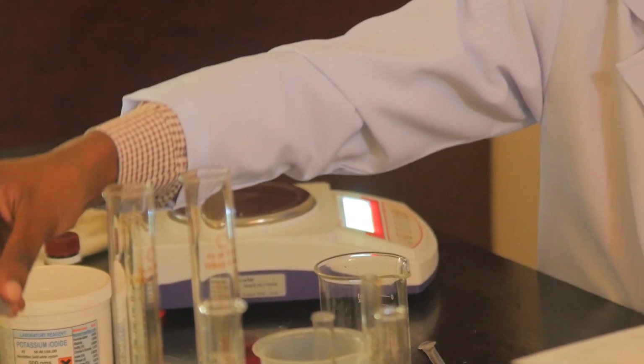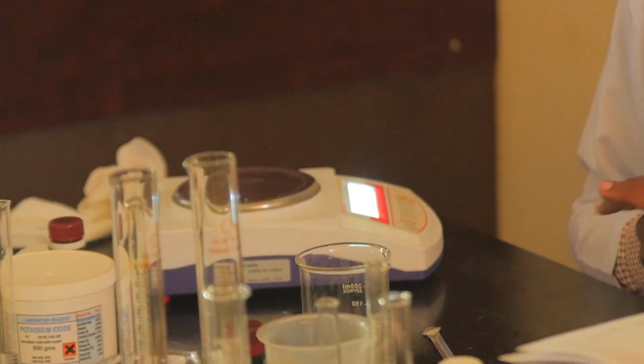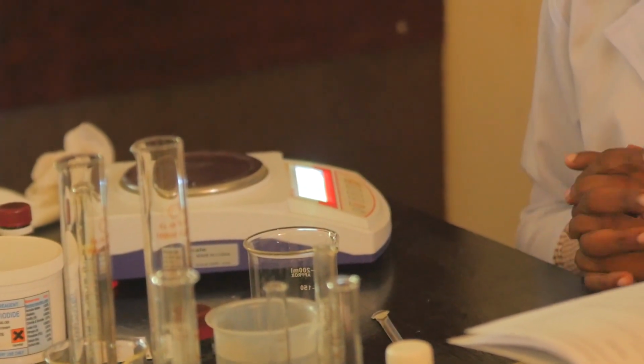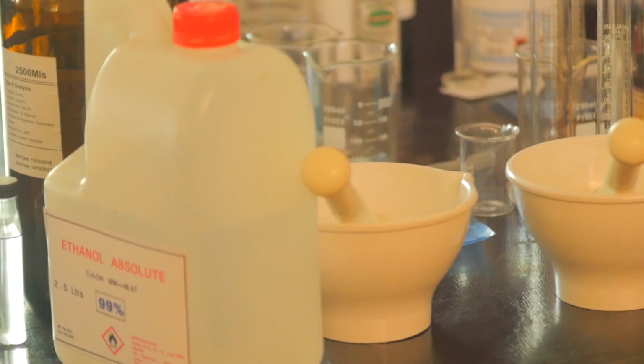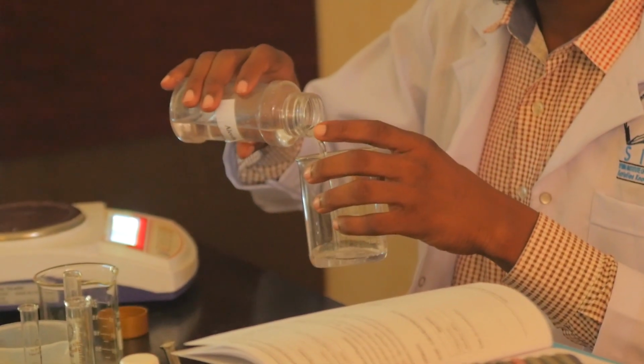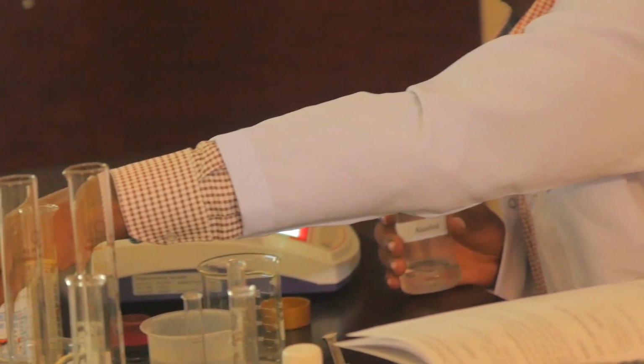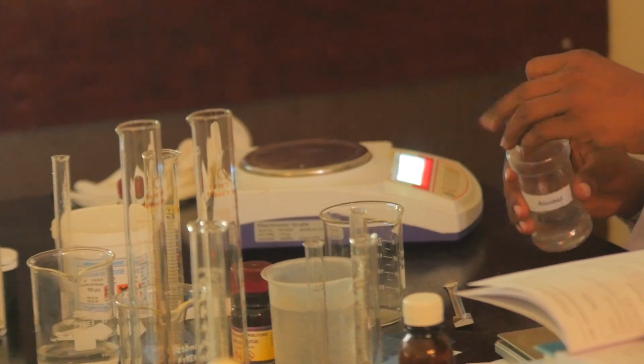After that, we are going to take some amount of alcohol. This is alcohol. Okay, this is alcohol. Now I'm starting my preparation.